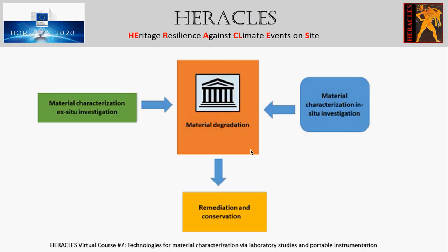The mode of operations ranges from non-destructive to slightly destructive, for instance. Most of them allow only spot measurements and provide information for very limited areas of the cultural assets. Therefore, selection of the most critical and interesting areas of the monument and a sufficient number are required in order to obtain a reliable and representative result.